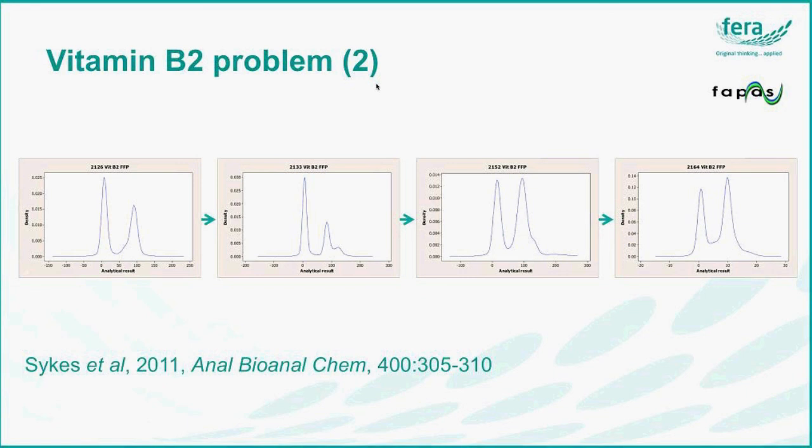The right-hand mode corresponds to participants that have correctly used the enzymatic hydrolysis as well as the acid hydrolysis. We can look at the trend of this over time, and in fact we published this observation 7 years ago in the journal Analytical and Bioanalytical Chemistry.